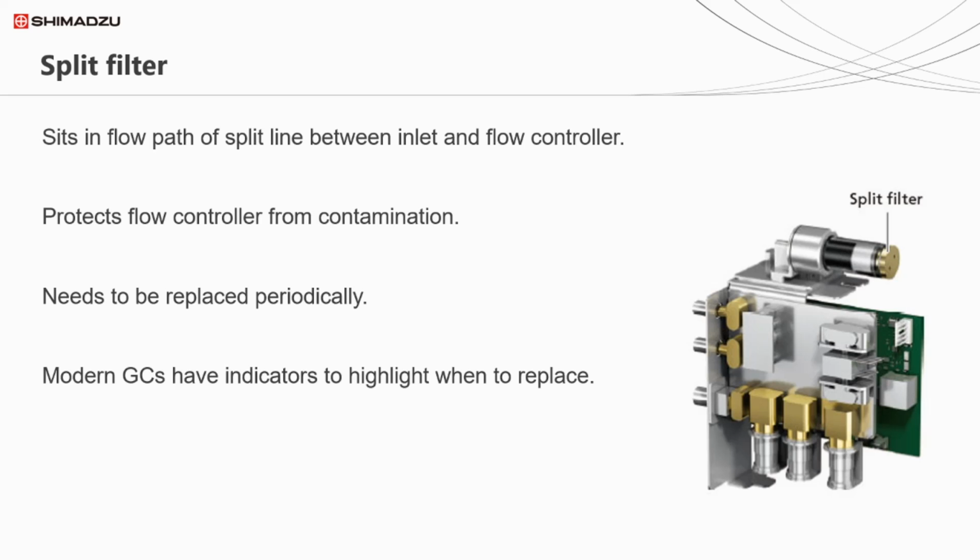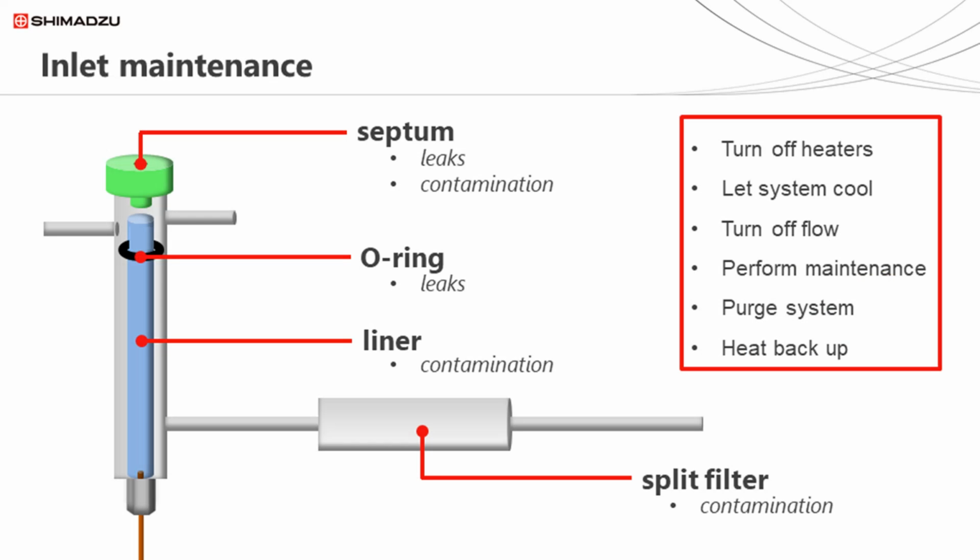Modern GC systems have indicators to highlight when the filter is saturated and when it requires replacement, and many now are exchanged without the need for tools. So that covers what's required for inlet maintenance.